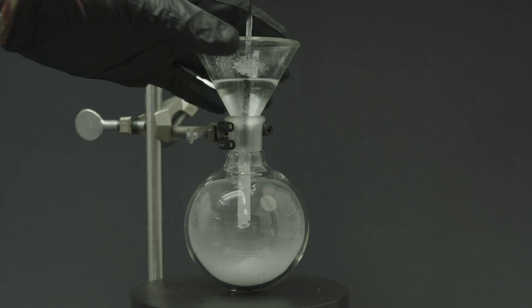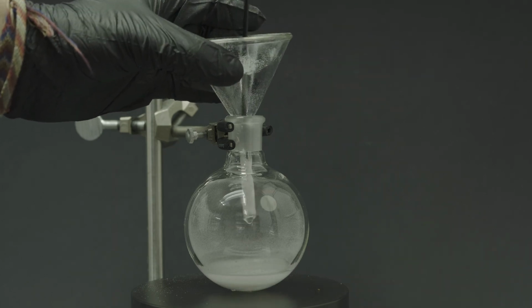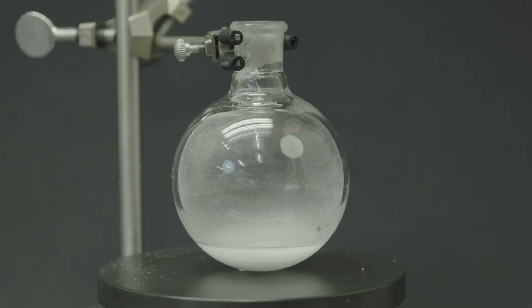After I poured in my acetic anhydride, I gave it a little push and it all drained into the flask. Next, I just threw in a small stir bar in order to get this reaction stirring nicely. Once I had the solution stirring, I just let it sit there. I knew that it needed a little bit of time to dissolve, and I was going to add in my catalyst soon.